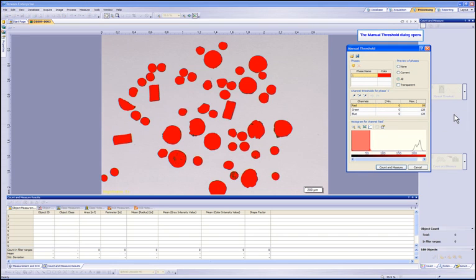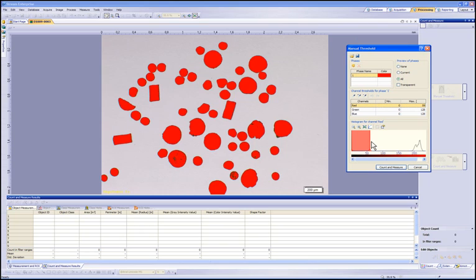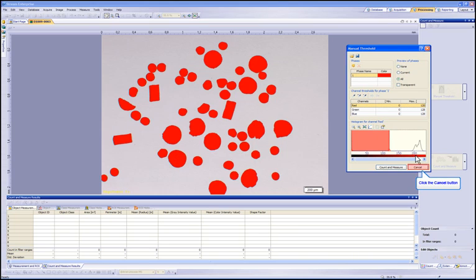With Manual Threshold open, you now have the ability to change the slider covering your histogram to include specific levels of intensity for each color channel, or by selecting to add or subtract ranges with the dropper tools. Let's cancel the Manual Threshold to use the automatic mode.